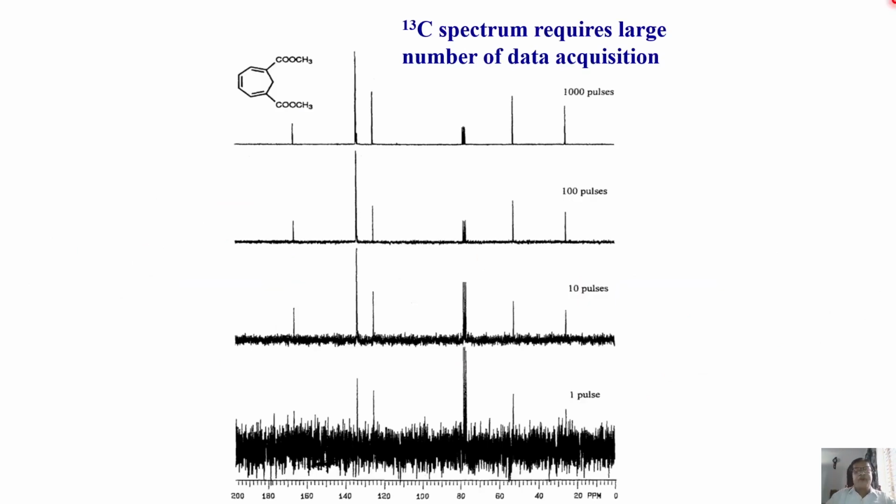That's why we keep on adding the data due to signal averaging. I'll tell you what is signal averaging when I come to practical applications, how to get the spectrum, how to process the data, everything I'll discuss in one of the classes. But till then, you keep this point in mind. We have to keep on adding the data.